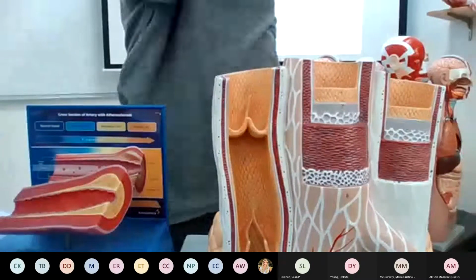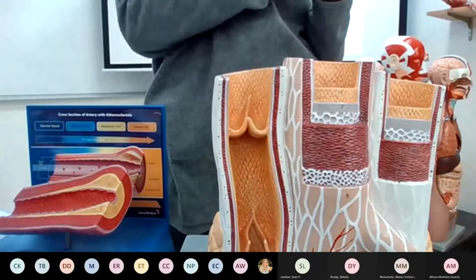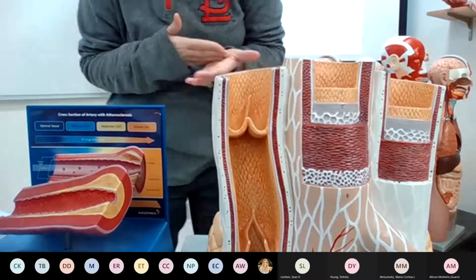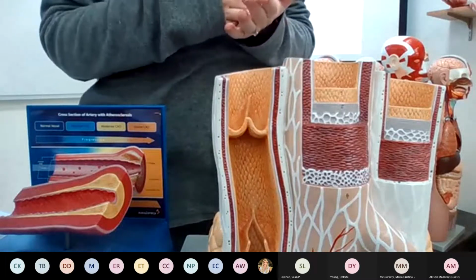Now, for every epithelial tissue, there's normally connective tissue right behind it. And that connective tissue is going to typically be areolar connective tissue.